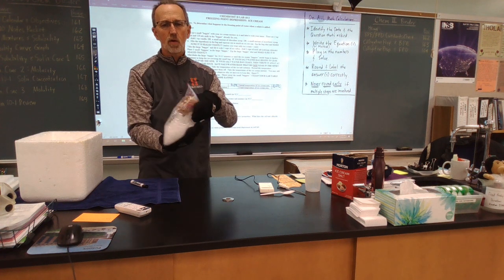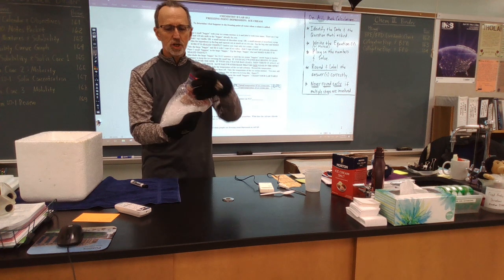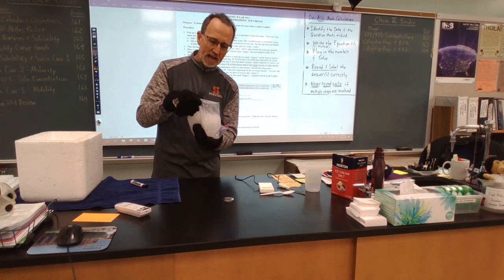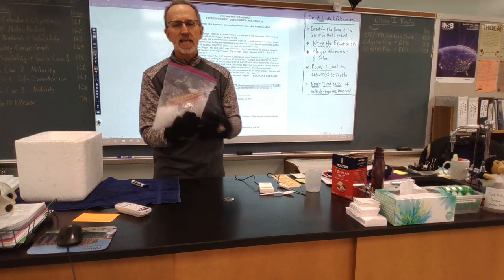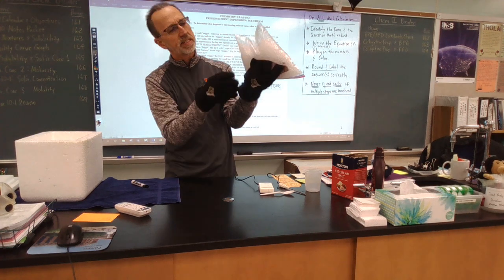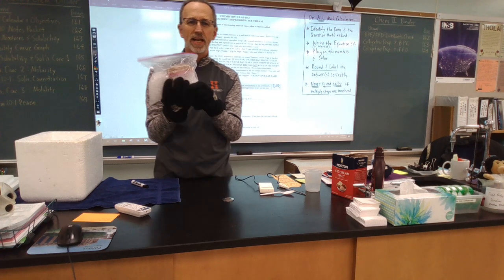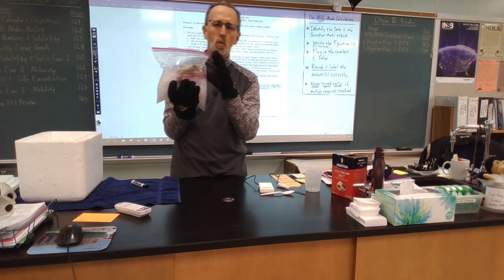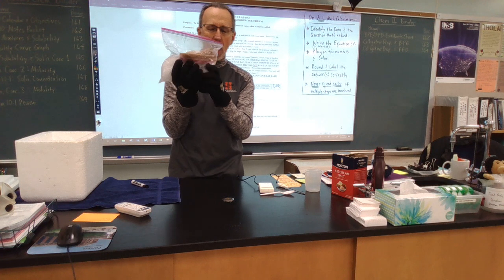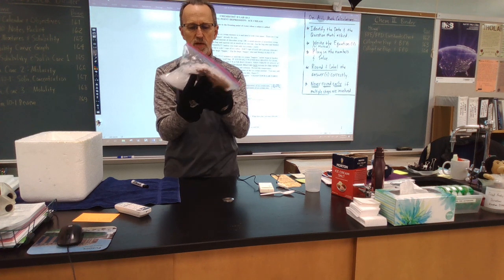What is happening is the rock salt is now mixing with the ice. The temperature is going to go down quickly, all right? And what's kind of interesting about this is as the temperature is going down, the ice actually begins to melt. I don't know if you can see it, but it's already started to melt. Very odd scenario. Because what we're ending up with here is a salt water solution that is at a much, much colder temperature than what normal ice is. Very unique situation.